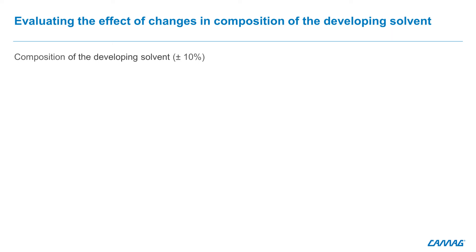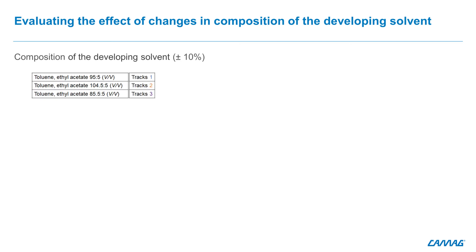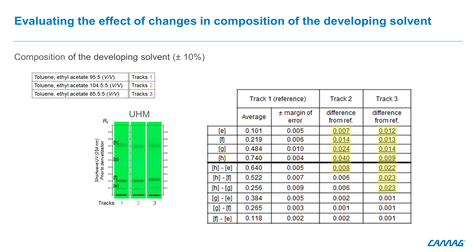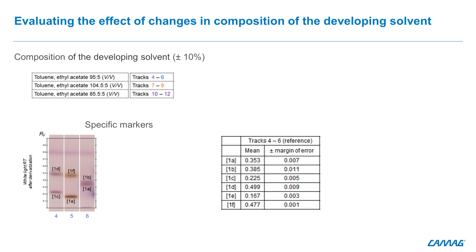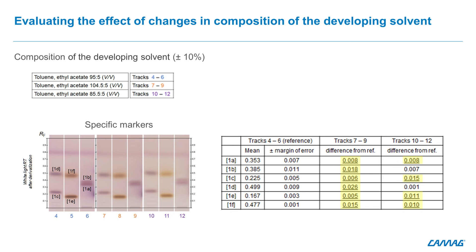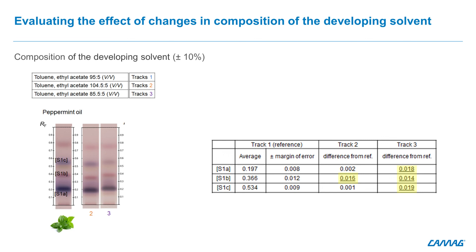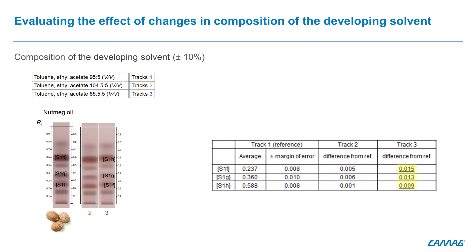The variation of ±10% in the composition of the developing solvent brings measurable change to the position of the components of the UHM. When looking at the UHM with the developing solvent toluene/ethyl acetate, the results show that by adding more toluene or more ethyl acetate, the components of the UHM can detect all the changes. Concerning the current SST and specific markers, when a variation of ±10% in the composition of the developing solvent is tested, the same observation as for the UHM is made. When looking at zones from the essential oil samples — peppermint oil, lavender oil and nutmeg oil — the data show the same observations: adding toluene or ethyl acetate will be detected in all cases.